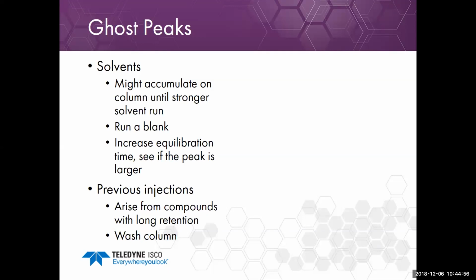Okay, and just a reminder to use either the chat function or the Q&A function to submit questions for Jack to answer. We do have one question that has come in, Jack. Is it recommended to inject the sample in mobile phase?